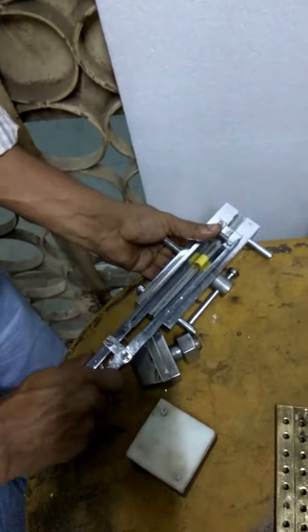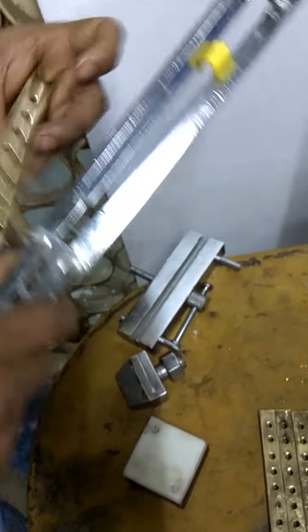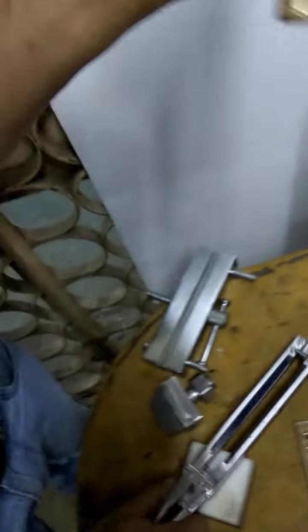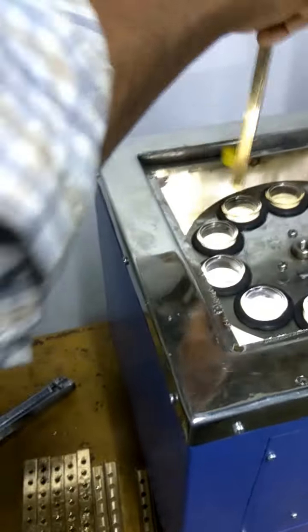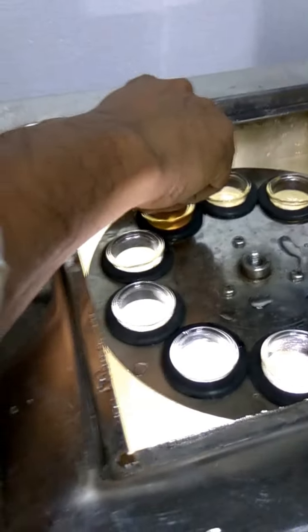With the transfer tool, it can be transferred. Keep the transfer tool and move it to the specimen holder, which is made of brass. That can be kept inside the test tube by way of just folding. Now you can see the sample inside the tester.